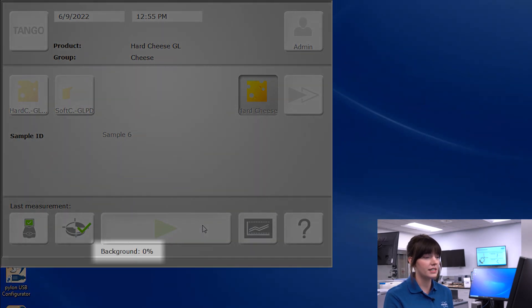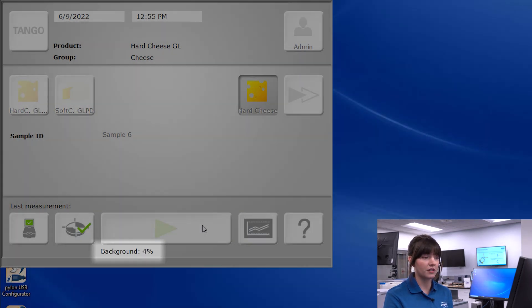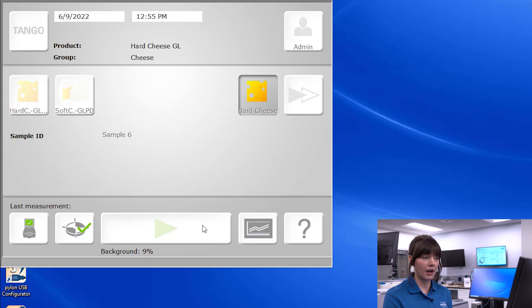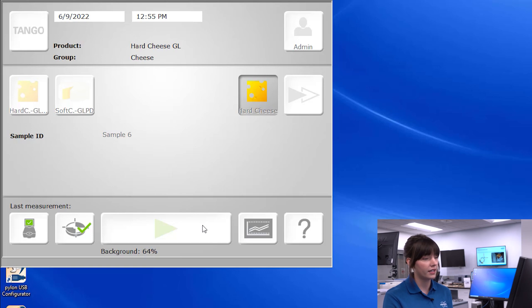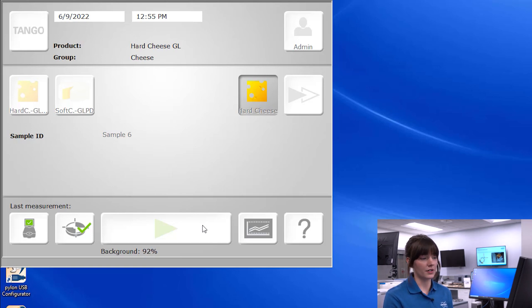Prior to a sample measurement being taken, you can opt for a background measurement to be taken. However, with the Tango, this feature is automated. The instrument will automatically close the unit's window, absorbing all of the light, and take a snapshot of the environment, the humidity, and the temperature at that point in time.